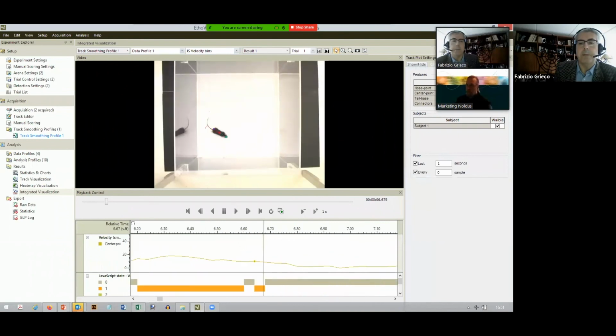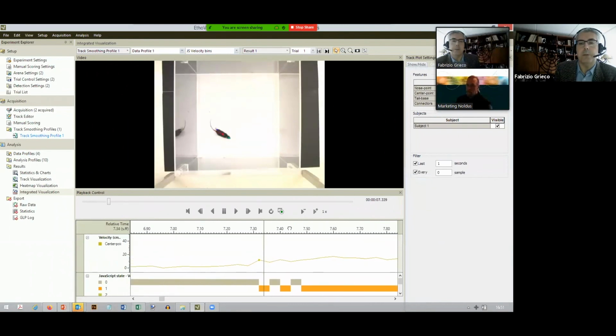There may be these fast transitions between 0 and 1. This is caused by the random variation of the velocity around a threshold. What you could imagine is that in the code you can check that if the value is just above the threshold, don't change the state unless it also exceeds another threshold.